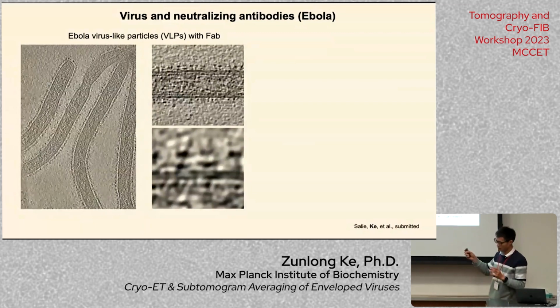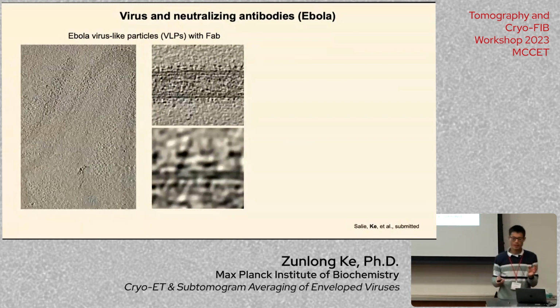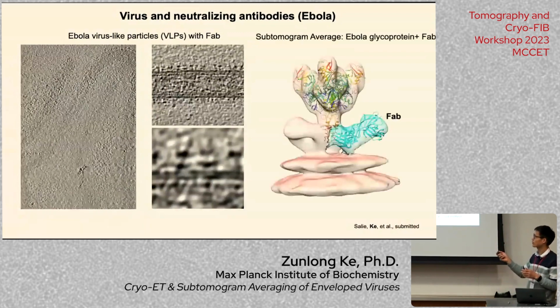What I did in this study is analyze the Fab fragments bound to this glycoprotein. Obviously, we pick the particles and the substructure of it.